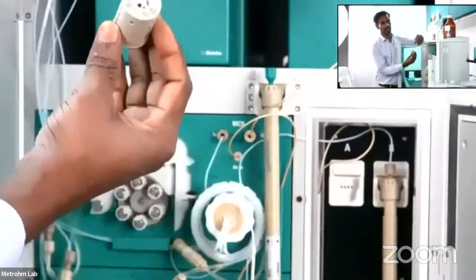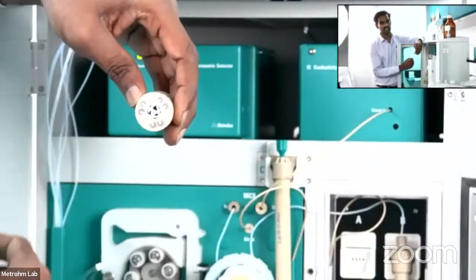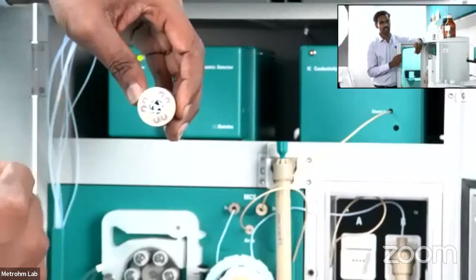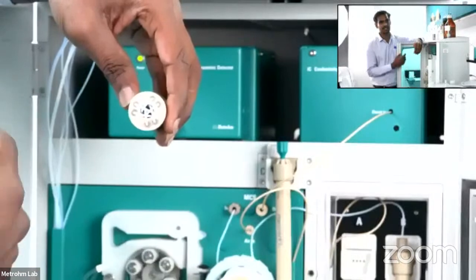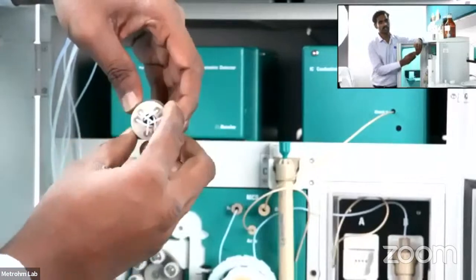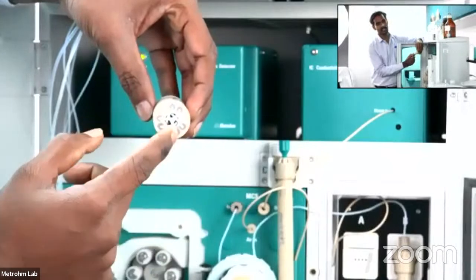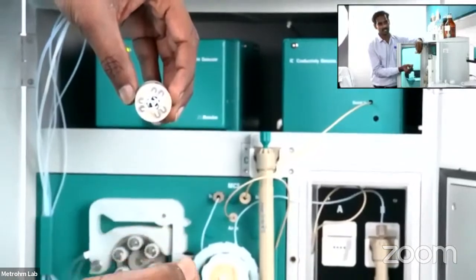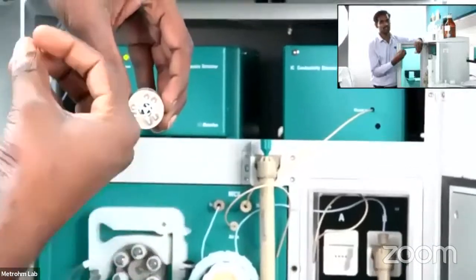Okay, so it has three identical chambers. You can see chamber 1, chamber 2 and chamber 3. Each chamber has a path in and a path out. One chamber is used for analysis, another chamber is used for regeneration, and the third one is for rinsing with ultra pure water. Once the analysis is completed, the rotor rotates in a clockwise direction by 120 degrees. The used cartridge goes for regeneration, and the regenerated cartridge goes to rinsing. Once it is rinsed, we get a fresh cartridge for the next analysis.